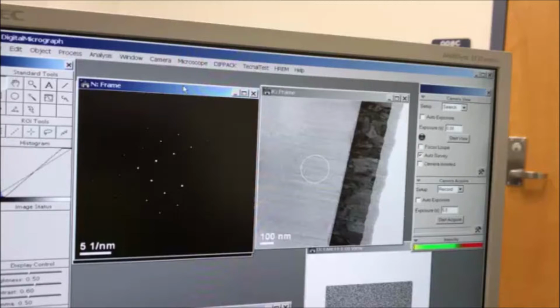And so I know, based on the orientation of the wafer and how I align the sample in diffraction mode, what zone axis I'm looking down and what my diffraction pattern is going to look like, so I can establish the correct parallelism.